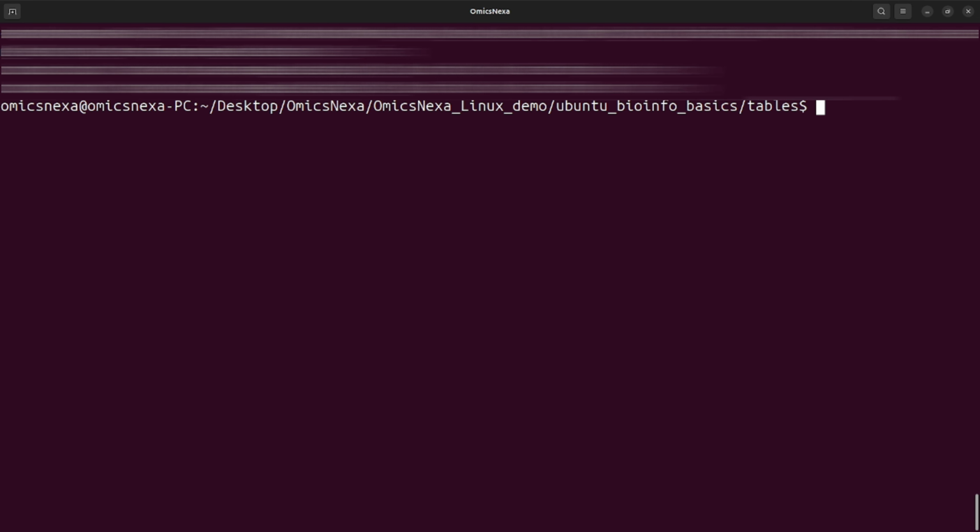In this part, we are going to build directly on those fundamentals and move closer to the kinds of operations we actually perform in bioinformatics. We will begin by learning how to work with many sequencing files at the same time using file name patterns. Then we will learn how to search for files, inspect FASTQ files, work with compressed sequencing data, verify file integrity, inspect computational resources, and eventually automate commands using a simple bash script.